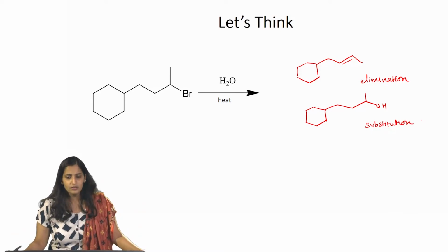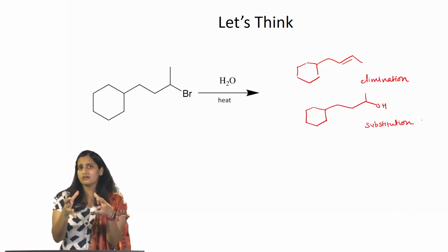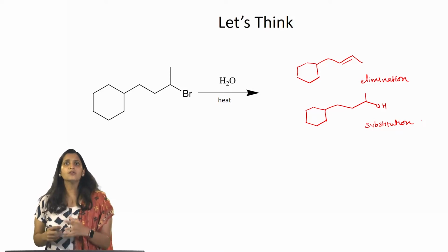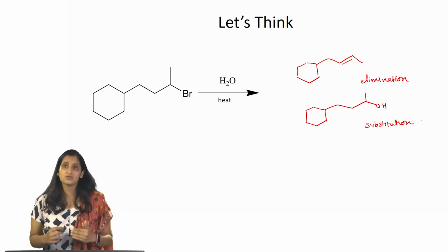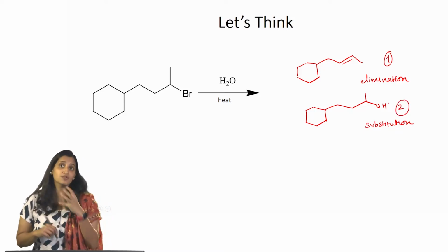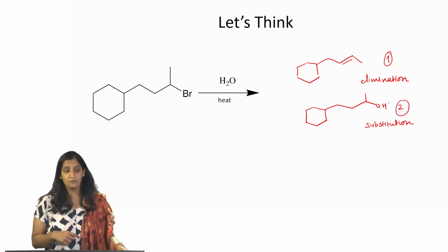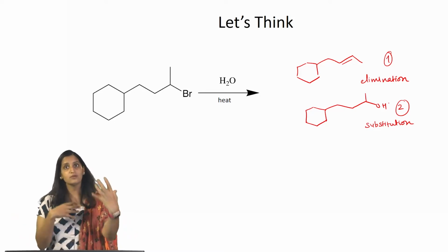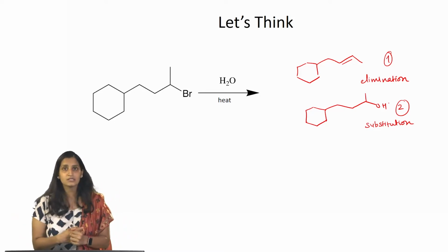Now, because you have done the reaction in a flask and formed the product, you want to know which one of these two reactions has really occurred. Is it elimination or substitution, or is it a mixture of the two, a good mix of these two things?